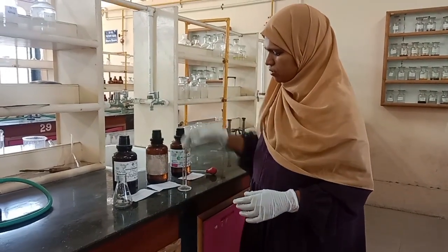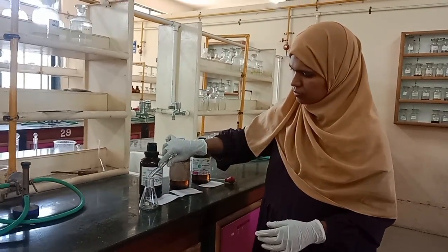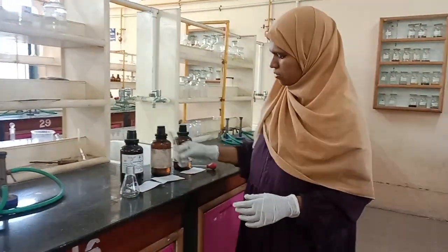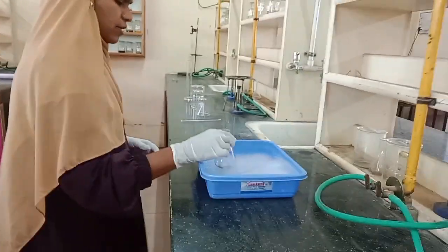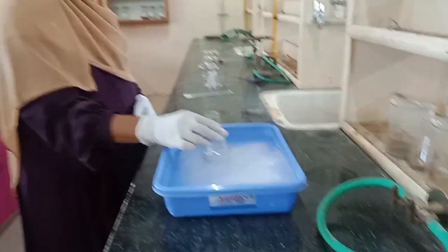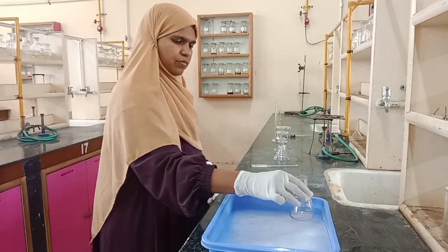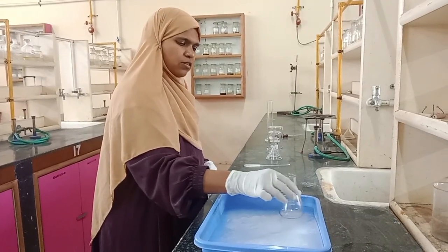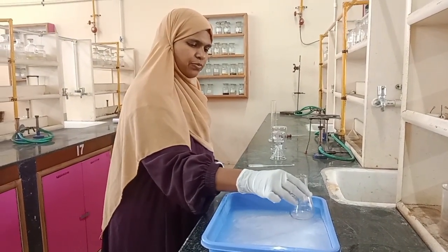This is the 2 ml of concentrated sulfuric acid. Cool it in an ice bath. Your conical flask is hot due to the concentrated H2SO4.